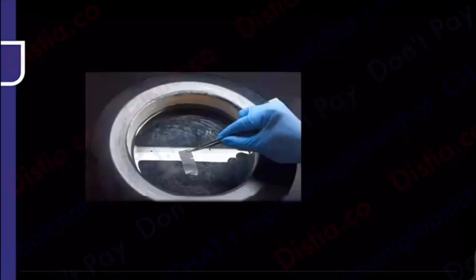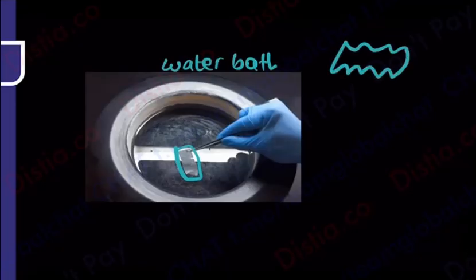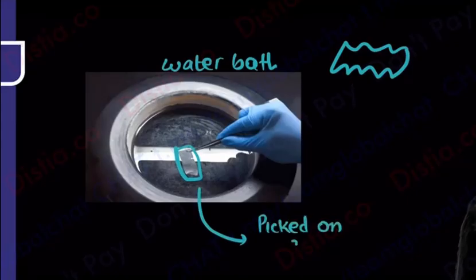So you'll say, look at this, ma'am. Finally, your tissue has been cut. This is one cut slice which you put in a water bath. Why? Because the paraffin will be cut like this, zigzag. You'll say, I want to straighten and flatten my tissue. I put it in a water bath and it gets straightened. I put it on a slide finally. This is going to be picked up on a slide.